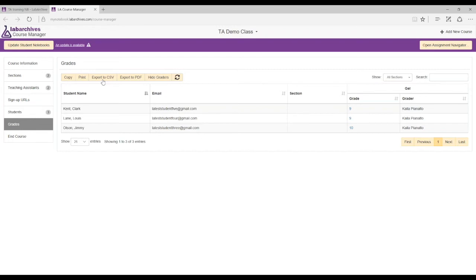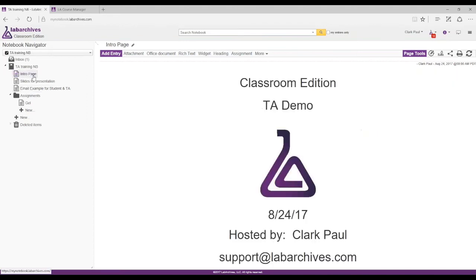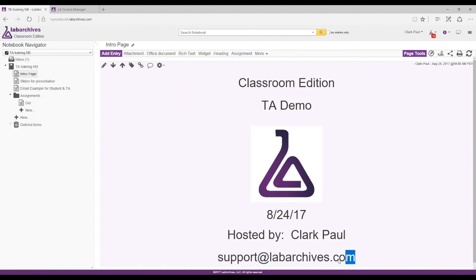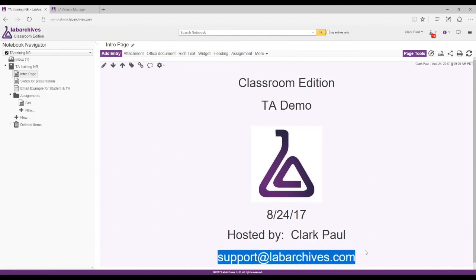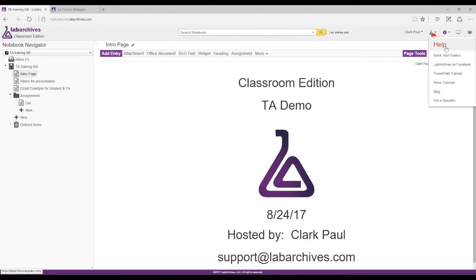From a TA's perspective, that's it — pretty easy and straightforward. If you ever have any questions, send an email to support@labarchives.com and they'll get back to you very quickly. Also, in the upper right-hand corner there's a little 'i' icon with a knowledge base — you can open that up, type in whatever you need to know, and it'll give you an answer.